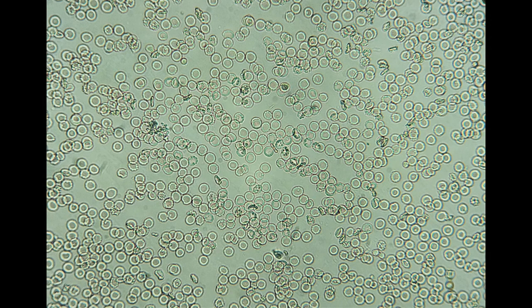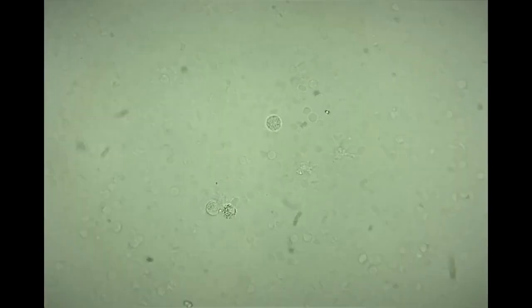In the slide containing the isotonic solution, the RBCs do not exhibit significant change in their cell shape or volume. They retain their normal turgidity. The RBCs exposed to hypotonic solution become swollen to such an extent that many of them could no longer retain their cellular integrity and have ruptured. The slide shows a murky appearance with only few swollen cells visible. These ruptured RBCs are commonly referred to as RBC ghosts.